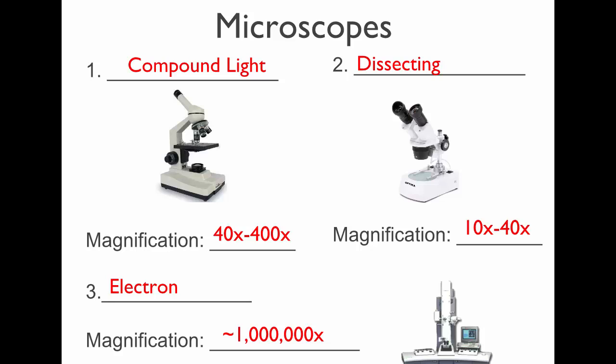So we don't have an electron microscope. They're relatively expensive, but they do have one at Whitesboro High School. I got to use it last year. They had to set up a whole separate room in their school for their electron microscope. But it's really neat. I went there last year, was able to use it.